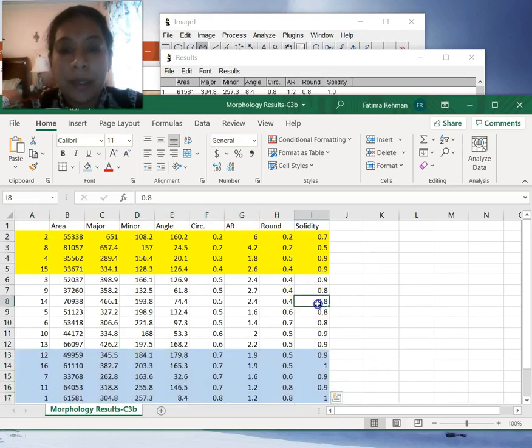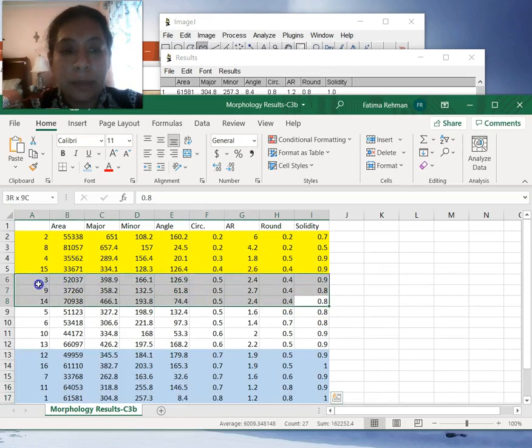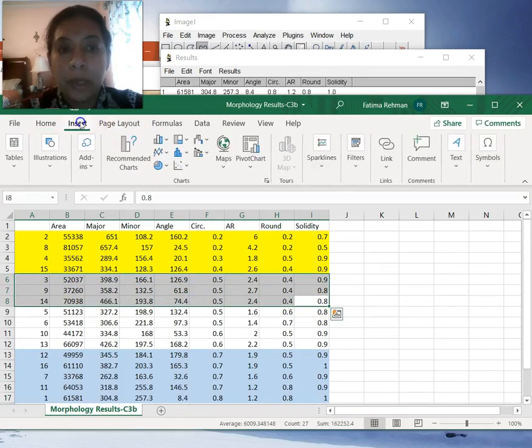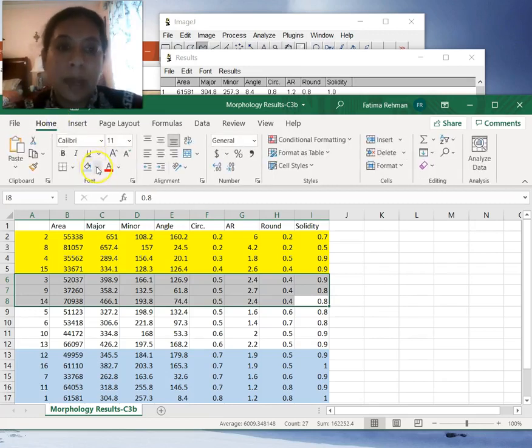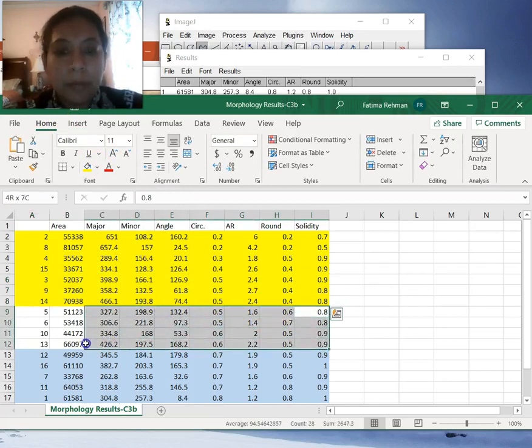So any of these where the roundness is still below 0.5, we can place them into our elongated or beginning-to-elongate form. So they are not quite elongated all the way, but they are beginning to show some signs, and they are moving in that direction. And the numbers that are 0.5 and above would end up towards your completely undifferentiated side.